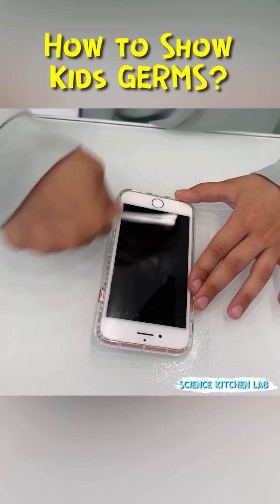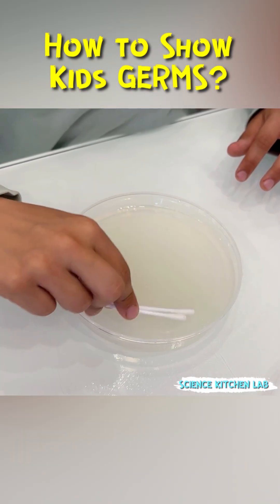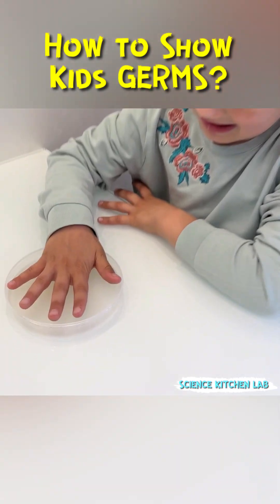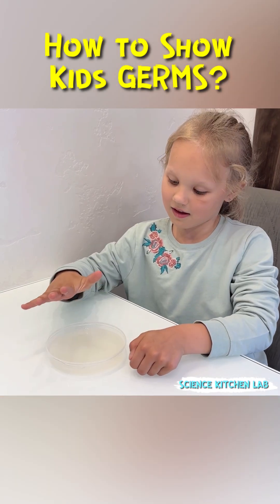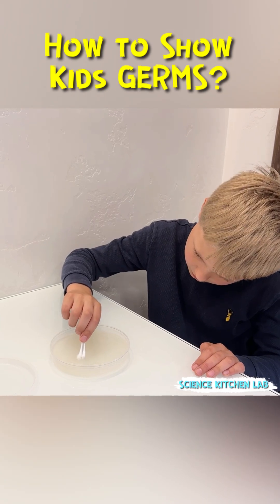The most interesting part is collecting samples using a clean cotton swab. Swipe across various objects, then across the agar agar surface. You can also touch the gel with dirty hands, sneeze, or breathe on it. Leave one container open for an hour to collect microbes from the air.